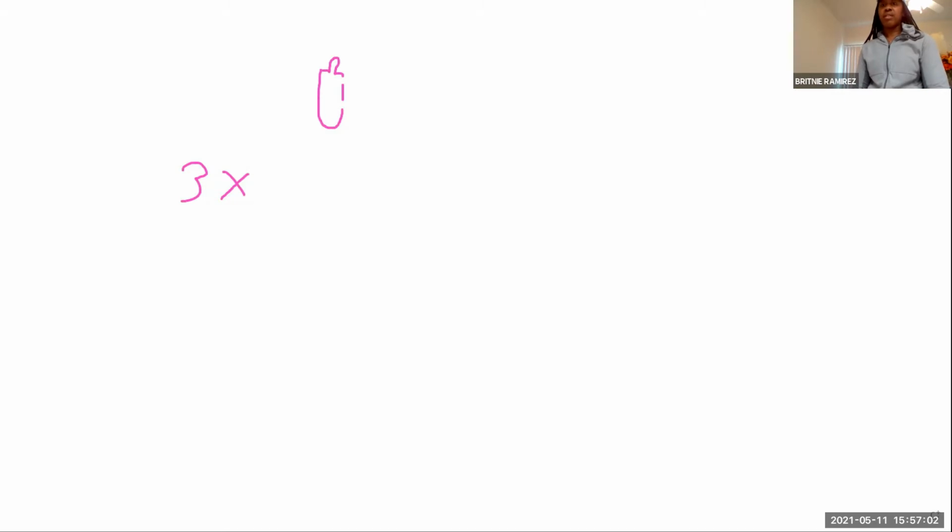Maybe it's not enough. Yeah, so acidity regulator in ours. In other words, if you have an acidity regulator, basically you're getting rid of the acidic property. So it's making it more neutral. Oh my God, are you serious? Yeah, so in your case, it isn't going to work.